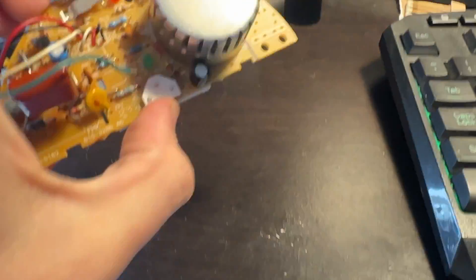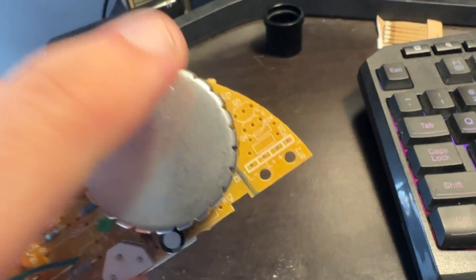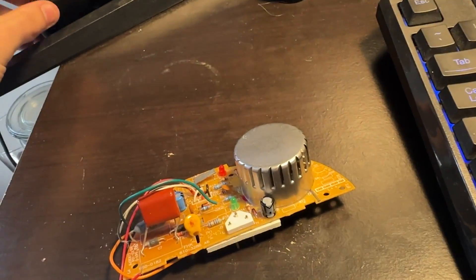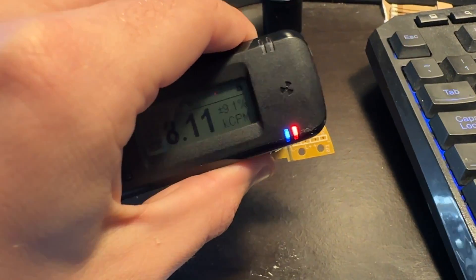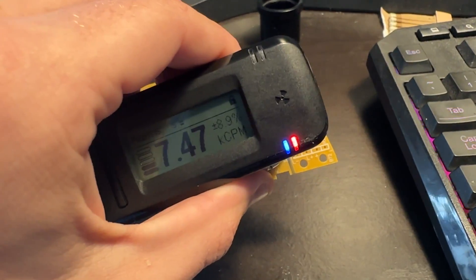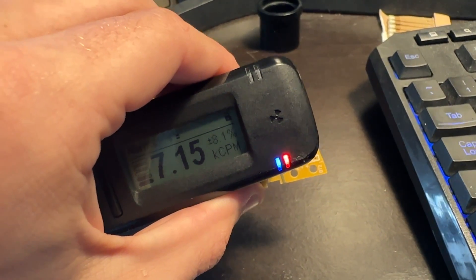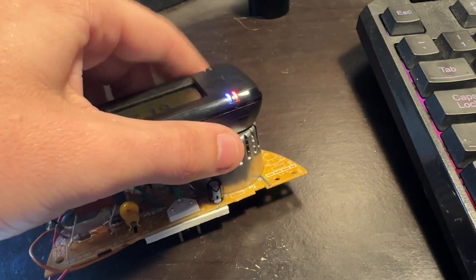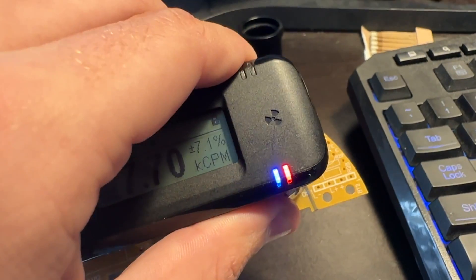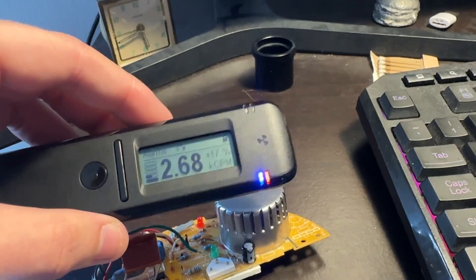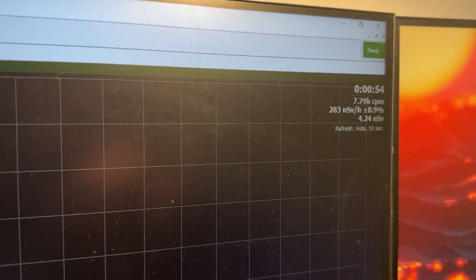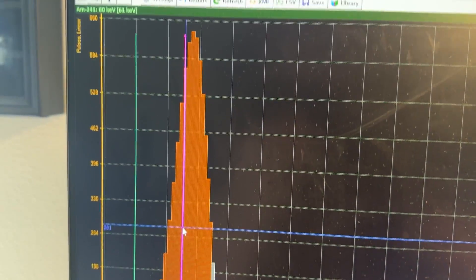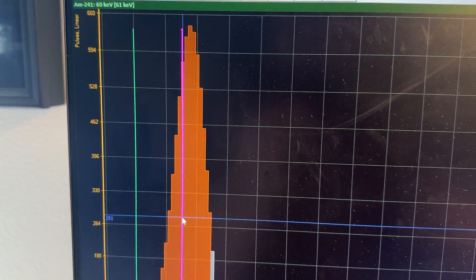Okay and now I got this circuit board with this suspicious thing on it. So let's see what that is. It is indeed radioactive. It's actually very radioactive. 7,000 counts per minute roughly. And climbing. Let's go ahead and run our spectrum on it and figure out what that is. Okay and only at 54 seconds in we can clearly see that this is americium 241.